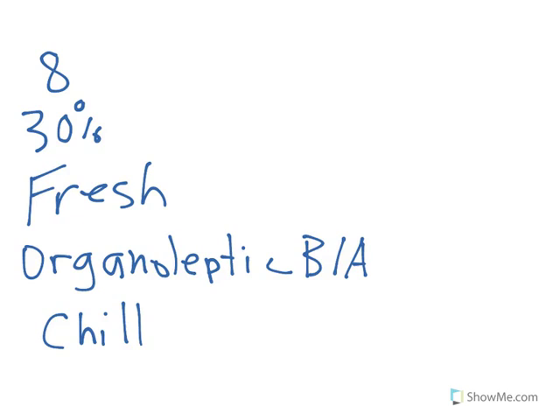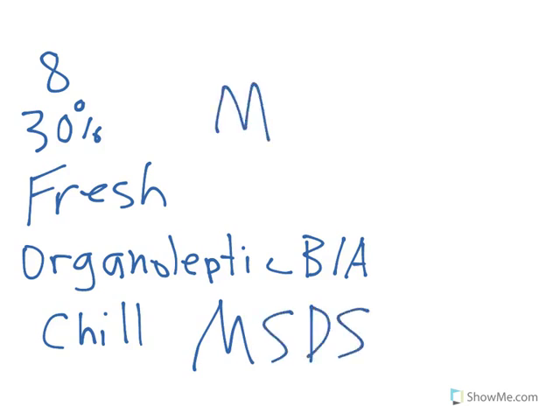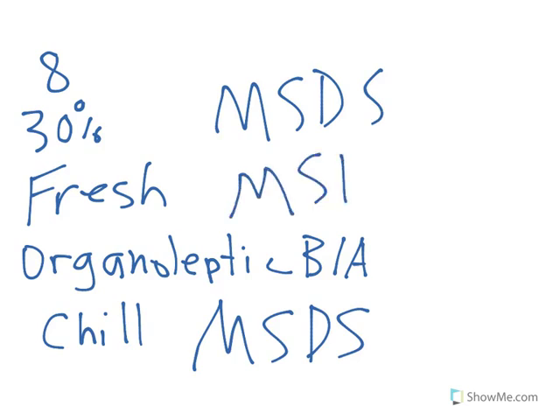measurement from it. You have a right to know what chemicals you're working with. And the way to look that up is through MSDS sheets. MSDS. That is how you really know what the chemical is and how harmful it can be to you. And so thank you very much. This concludes part 4, and good luck on the test.